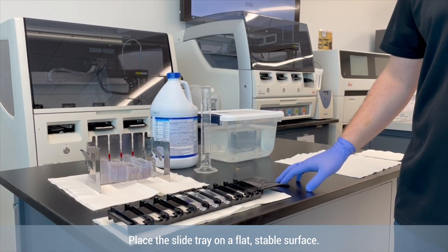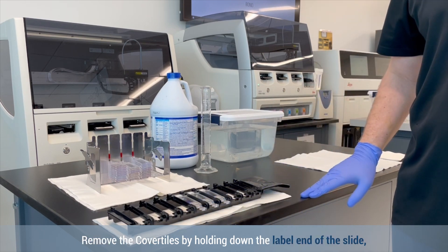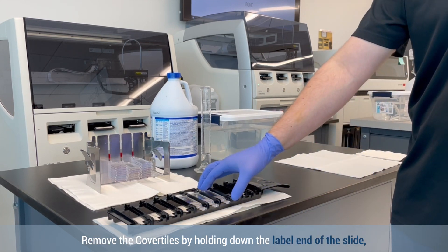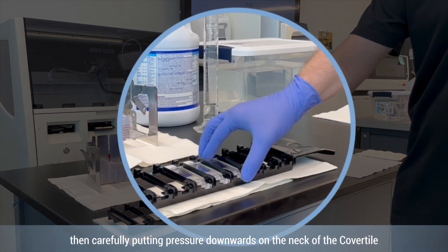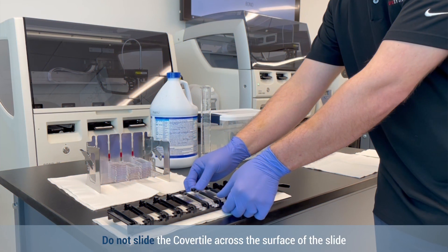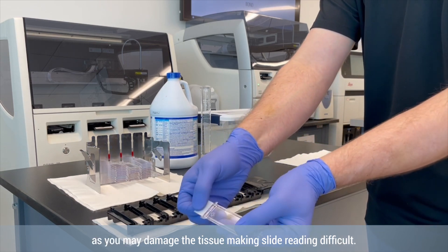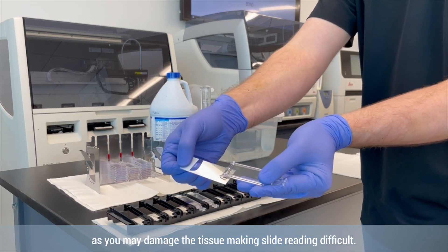To clean the cover tiles, place the slide tray on a flat stable surface. Remove the cover tiles by holding down the label end of the slide, then carefully putting pressure downwards on the neck of the cover tile to lift the end of the cover tile off the slide. Do not slide the cover tile across the surface of the slide, as you may damage the tissue making slide reading difficult.